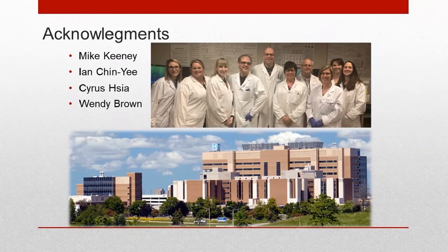Great. Can you speak to the cost effectiveness of this product, especially versus homebrew? I think just user-generated panels, I suppose. Yeah, I mean, that's always the question, right? Typically, if you can make it yourself, it's cheaper. I can't speak to that because I am not a Beckman Coulter employee. However, what you're getting with this is the whole system and an IVD approval.